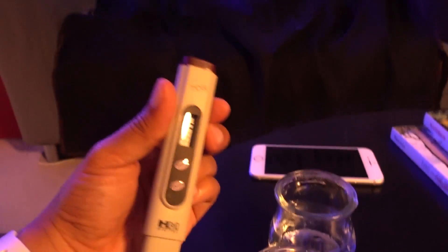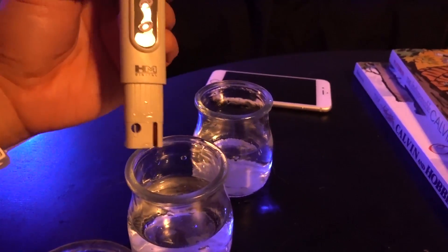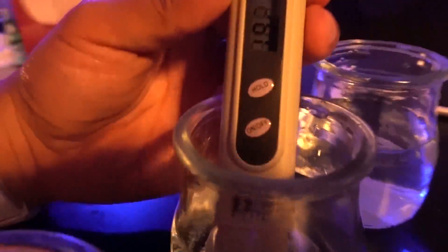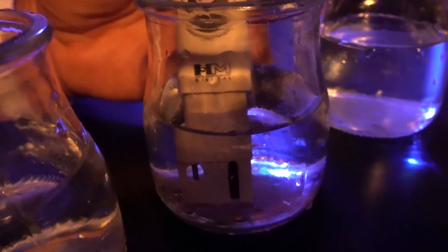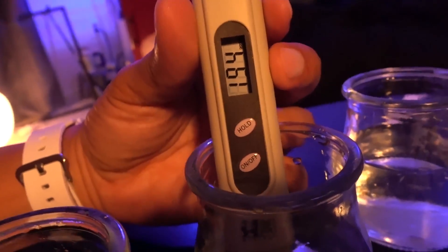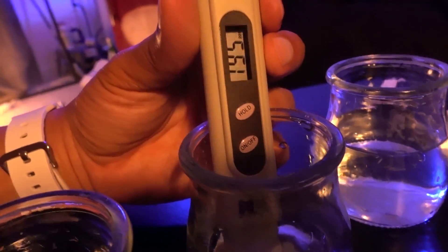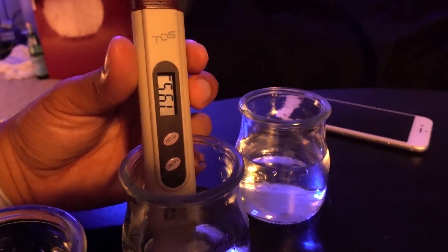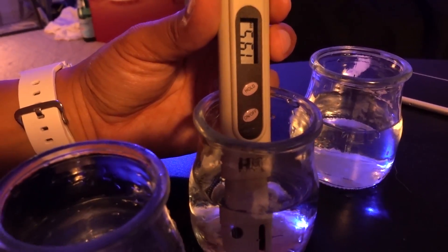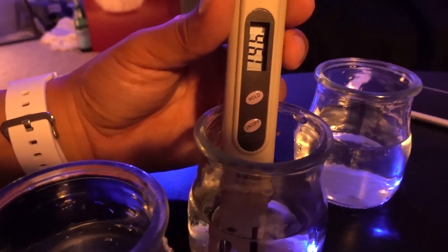Next we have the tap water coming out of my faucet. This is gonna be a surprise for me too — I've been using this water for a long time. Let's see what I've been dealing with. Holy smokes — can you guys see this? 193 to 194! I don't know what that number means exactly but that sounds really high. I've been using this water in my fish tank for a good year.